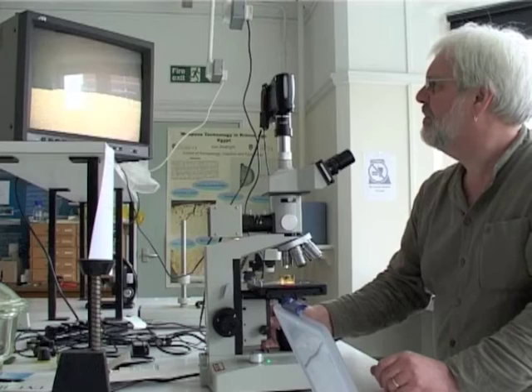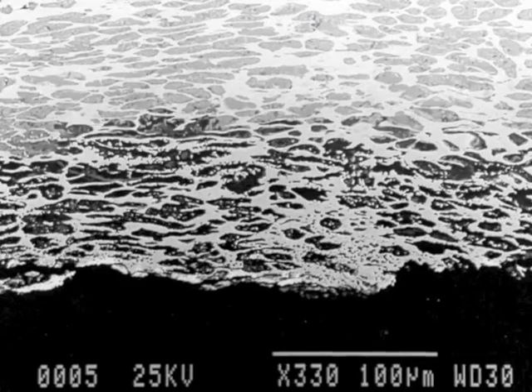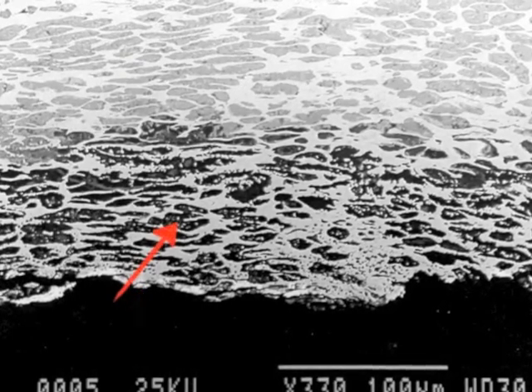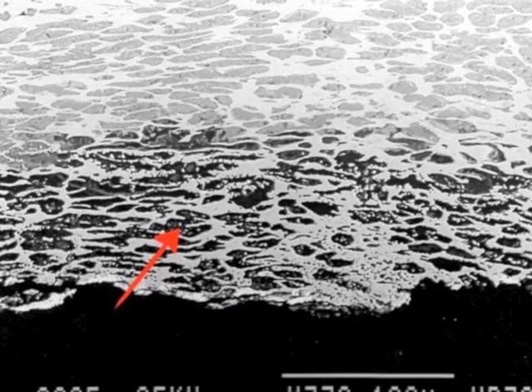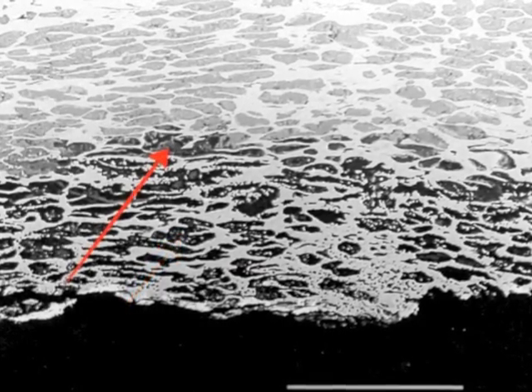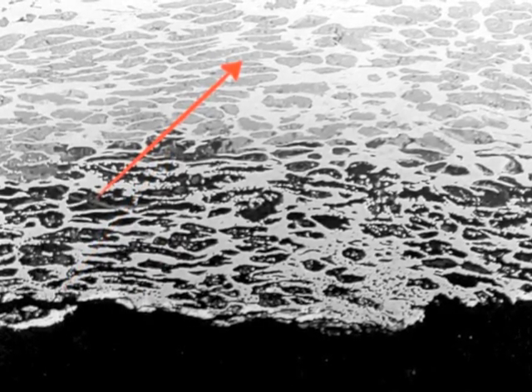This honeycomb or crunchy bar structure could then be consolidated by the striking process. Using a microscope, we can see the effects of this depletion process on a section cut through a Roman imperial silver denarius. The bottom edge marks the surface of the coin. Behind that is the enriched zone, which appears as a matrix of silver with dark voids where the copper has been leached out. In this case, the zone is about a tenth of a millimetre thick. Behind that, we start to see the presence of copper, and finally we reach the heart metal of the interior, where the copper survives intact.